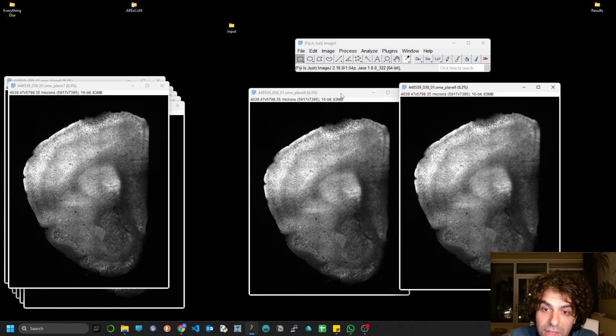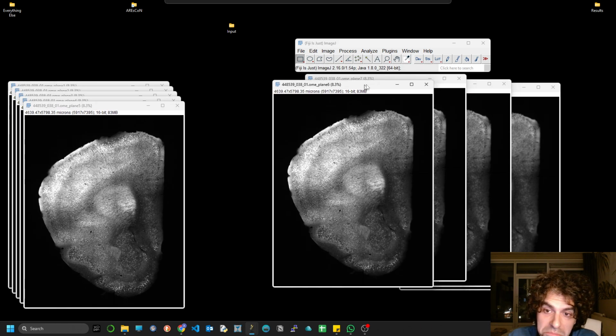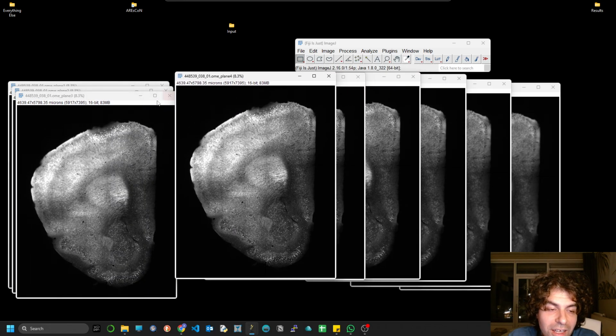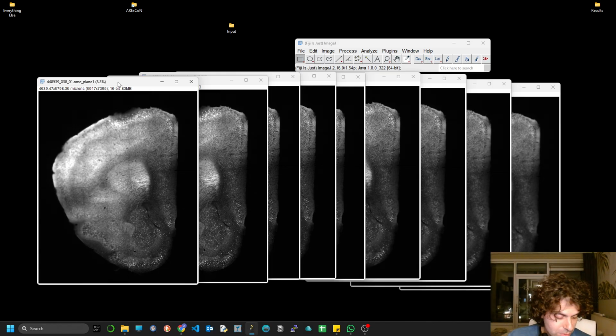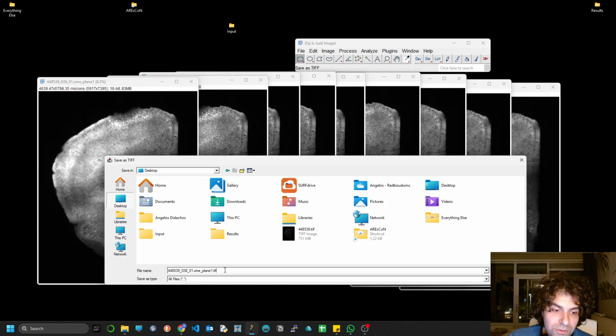And what I'm going to do now is that I will just save each one of these stacks. I will show you how to do the first one. I'm quite sure you're experienced with that, but that's okay. And then I'll continue with the rest. I'll just pause the video for a while, and then I'll continue with the next step. So to save, you can do Ctrl S, which I prefer, and we have our plane. Alright, and I'm just saving it as plane 1, and I'm going to do the same for all the rest of the planes.